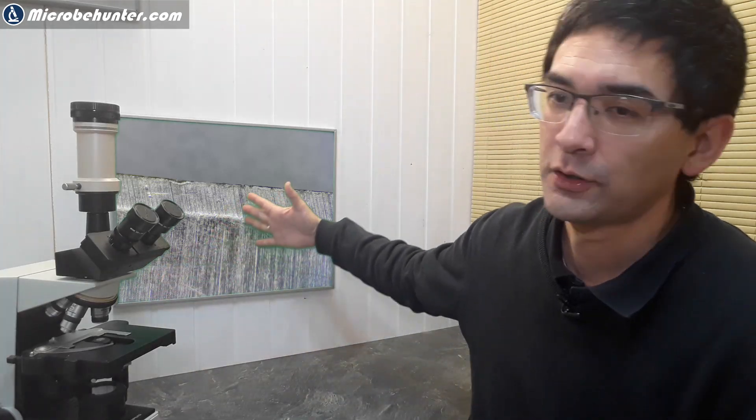Because sometimes, especially with the higher magnifications, the working distance is so extremely small that shining a light from the top is quite difficult. The angle has to be very shallow and then it's casting a shadow from the side. Then you need another lamp from the other side and then the problem is that the light intensity is not going to be high enough because the magnification is so high, so it's going to be too dark.